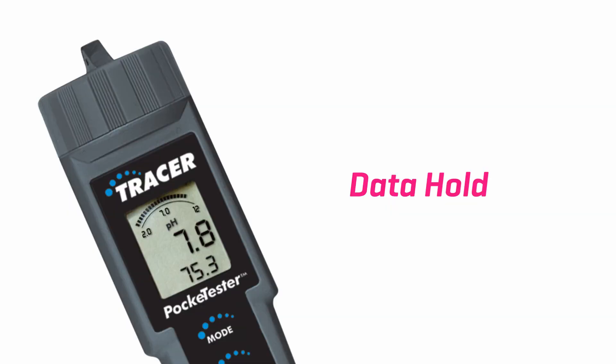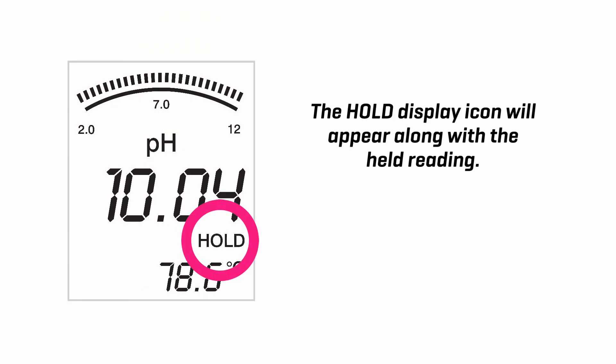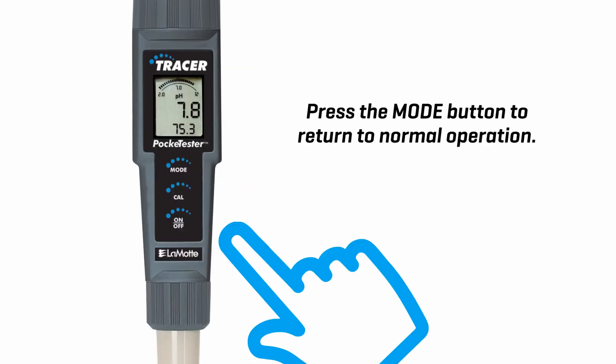Data hold. Press the mode button to freeze the current reading. The hold display icon will appear along with the held reading. The held reading will be stored in memory. Press the mode button to return to normal operation.